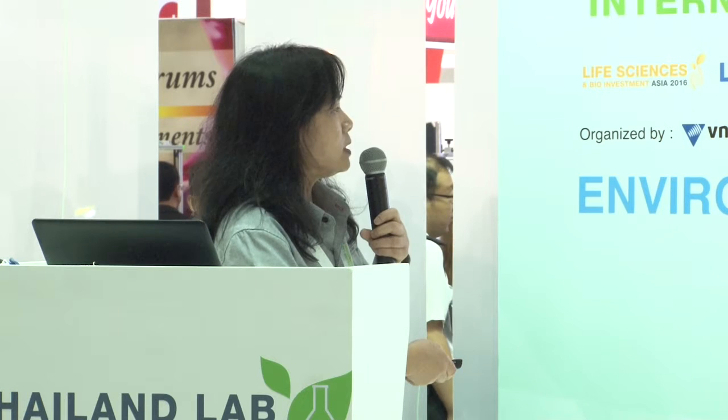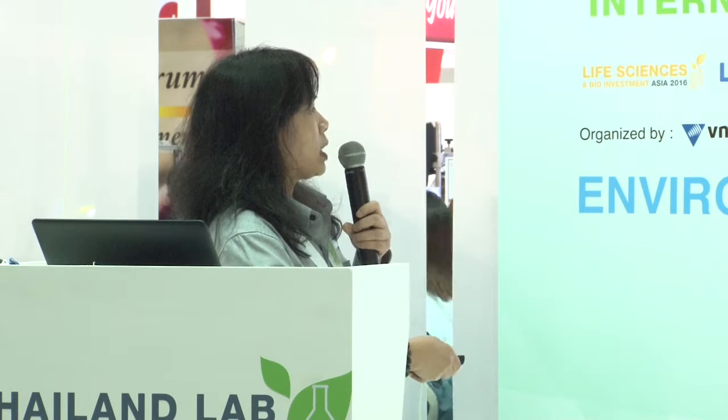So there's 78, there's 82, etc. So I can use 78. But even 78, they're interfered by argon 40 and argon 38. But because the percentage abundance of 38 is much smaller, I can measure selenium 78.